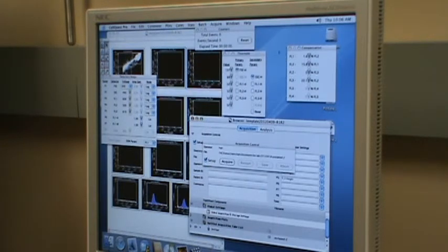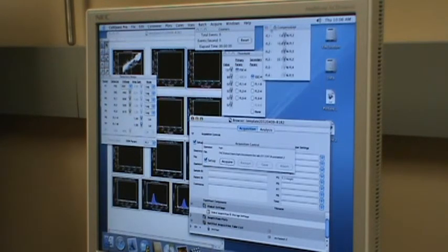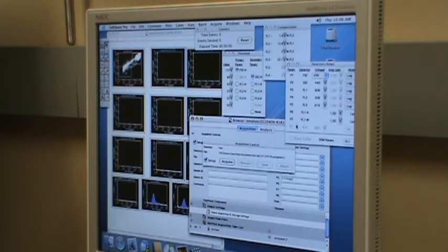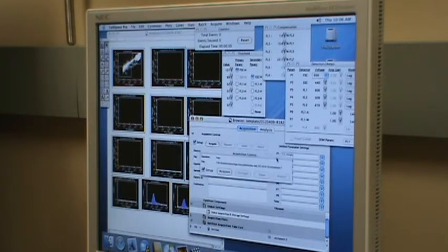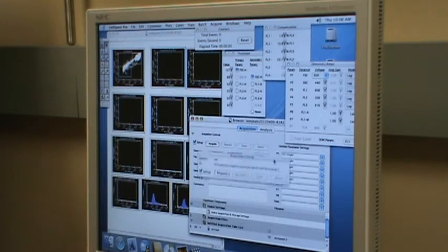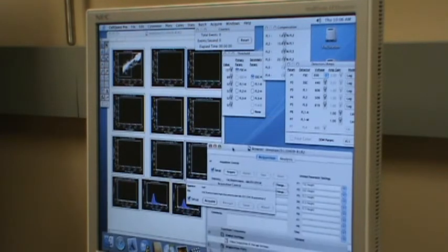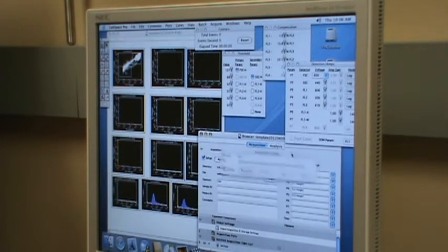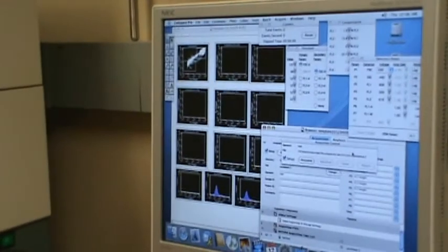Probably after some practice you will know why we need so many things. It's actually not difficult. After you run several times, it's much simpler than it appears. So don't be afraid of it.